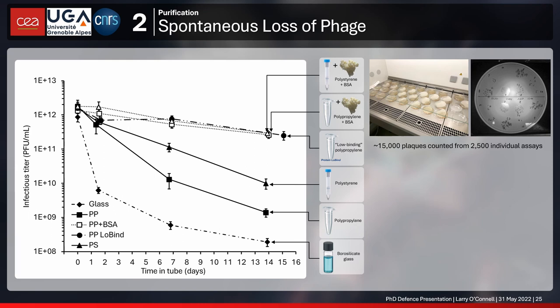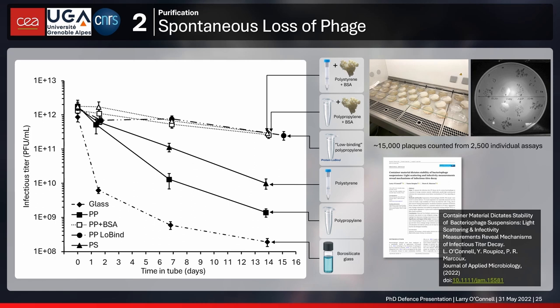What we found was indeed a dramatic loss of bacteriophages very quickly from suspension. The worst performer was actually glass tubes — after about two days we'd already lost 90%, then 99% of our phages. Polypropylene, which we had been using, is not that much better. We showed that borosilicate glass is by far the worst. However, if you pre-incubate the surface with BSA, you can really limit the loss of bacteriophage from suspension. We were happy to present this work in the Journal of Applied Microbiology.